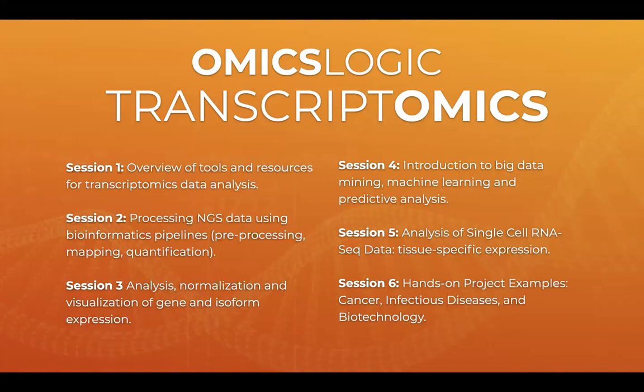So it's important to see how we account for all kinds of variation that are not related to the biological phenomena that we're studying. So we want to account for different ways of data preparation and different ways of original material that we have in our samples, all of those kinds of factors.